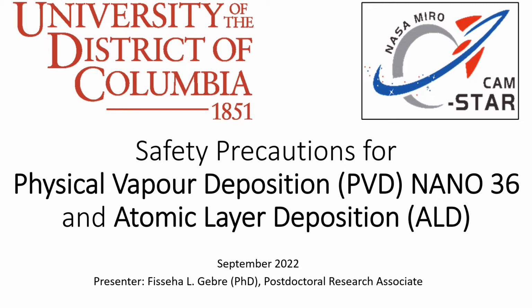Hello, this presentation is regarding safety precautions for physical vapor deposition, PVD NANO 36, and atomic layer deposition, ALD. These two machines are available in CAMSTAR lab at the University of the District of Columbia.